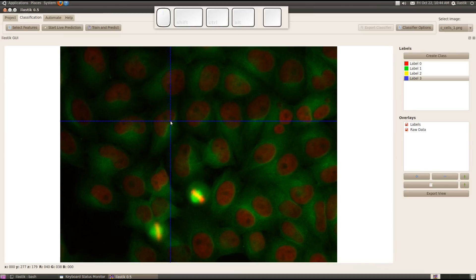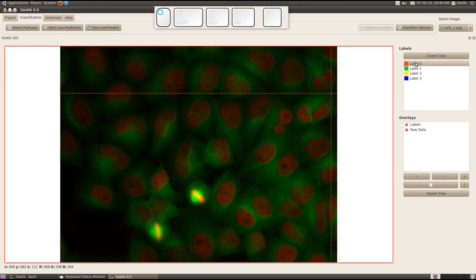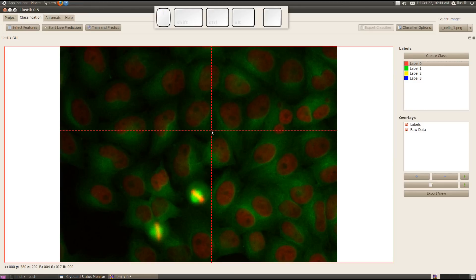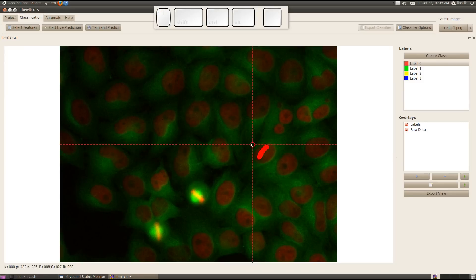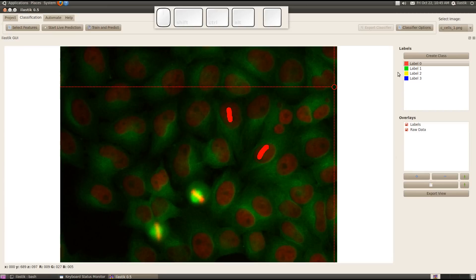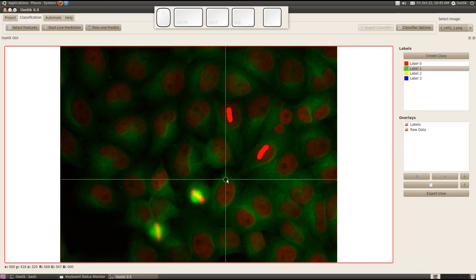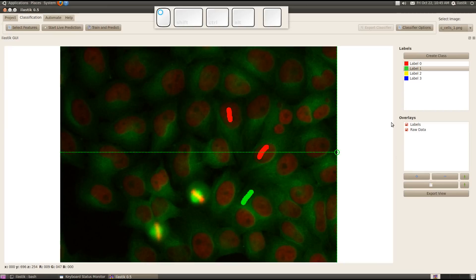I start labeling now by selecting class zero. I want to use this class for indicating cell nuclei. I increase the brush size a bit by pressing M and start to give my first label, labeling those two nuclei here. Then I change to the green class and indicate cytoplasm.